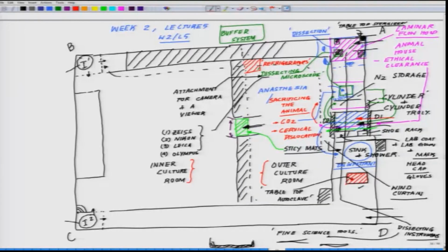And whenever you design that you want to place a refrigerator, you can have this part, the countertop, maybe cut at that point, and you can place the refrigerator in such a way that you are not consuming that space. Okay, so you'll have one refrigerator out here, depending on what is the strength of the lab. Now from here you move to the mainframe out here.